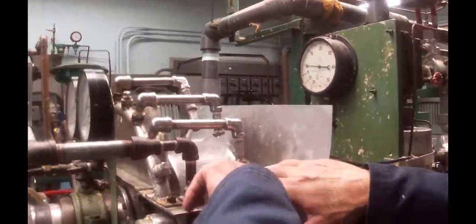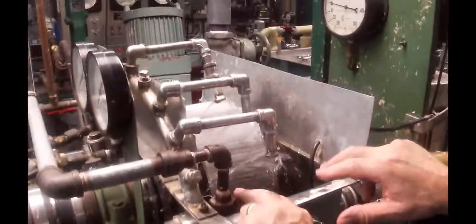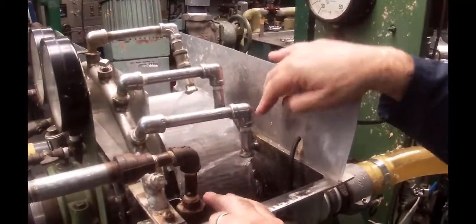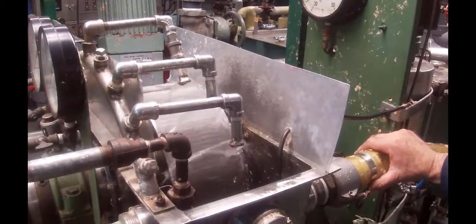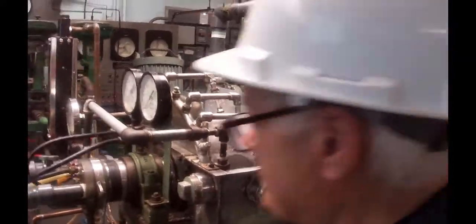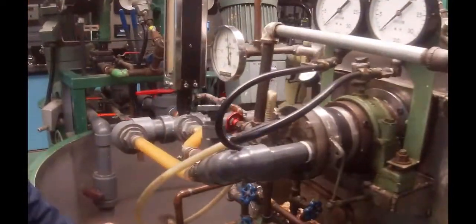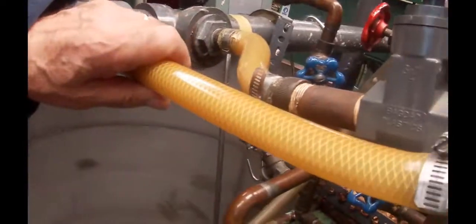You can see that the water is fanning out, and it's hot. It's fanning out in 3 sections, a little bit less on each one. And what that'll do is wet the surface, and then the vacuum will suck the liquor and the water through the mat. If you come to the side, I don't know whether this will pick up on your camera or not, but I can actually see the liquid coming out through there now. And if you look down into here, there's a little bit of liquid in there. Probably put a light on. And then come back around to the separator.